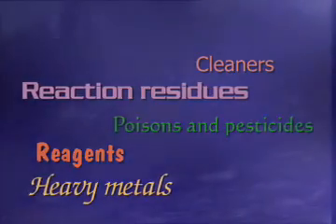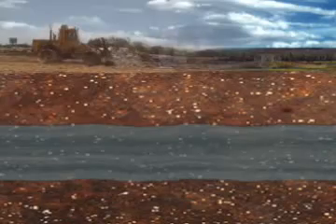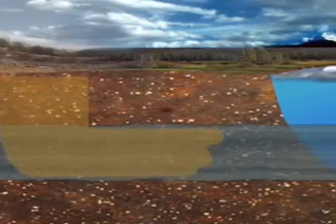Normal trash usually ends up in a sanitary landfill. But an ordinary sanitary landfill is not designed to contain hazardous constituents in the wastes. Waste materials can leach through to groundwater and escape into the environment. Any laboratory wastes that are hazardous must always be handled separately to prevent them from reaching the local sanitary landfill.